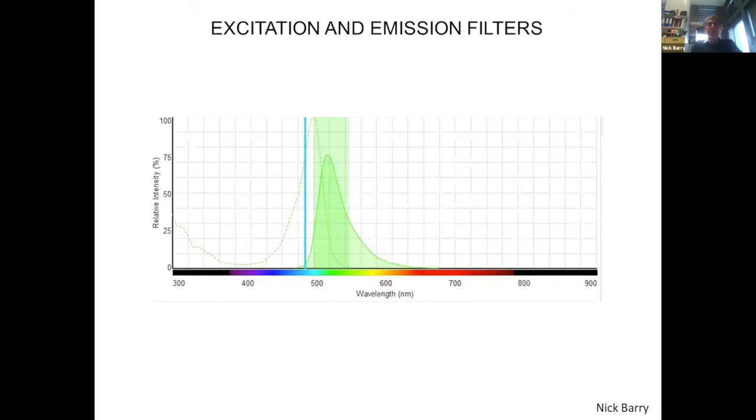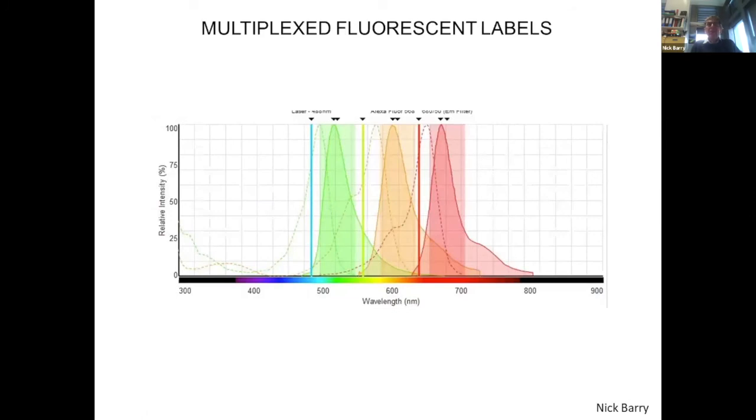So often in a laser microscope, you've got this single laser line, and then you've got considerable flexibility to put your emission filter in just to get all the green light out of this microscope onto your detector or the eyeball or a camera. And then you can multiplex, so you can have 488 excitation, 561, and 633 excitation.